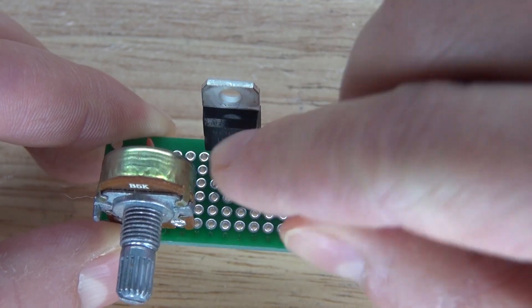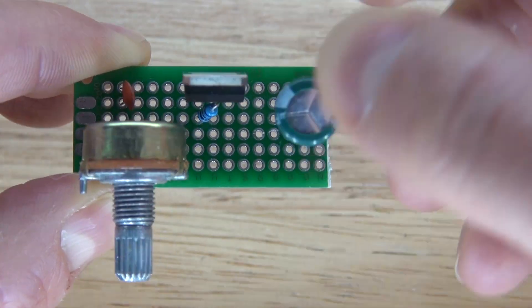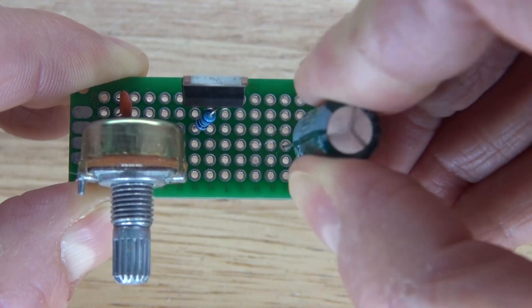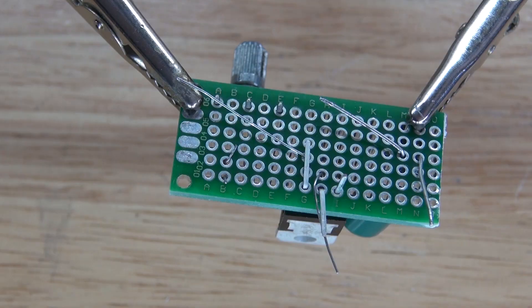Next you're going to take your 680 ohm resistor and connect it to the adjust pin and output pin, which is the left pin and center pin. Next you're going to take your 10 microfarad electrolytic capacitor, with the negative facing the left and the positive facing the right, just like this. Everything is now in place — now it's time to solder everything together.